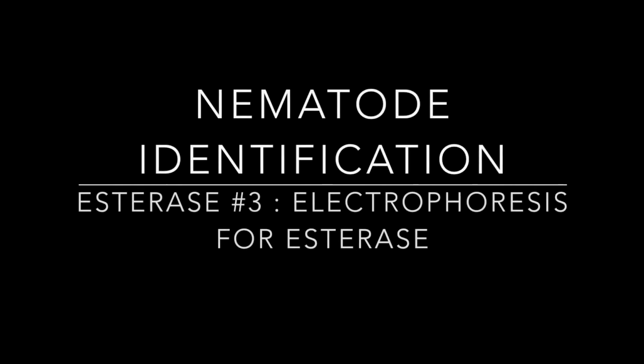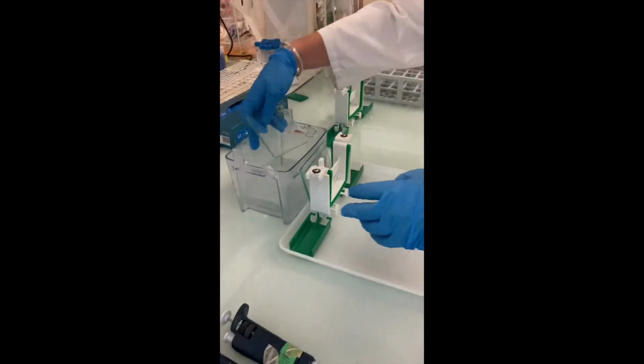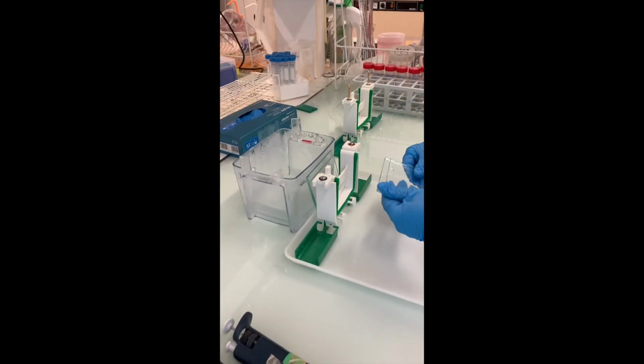Hello and welcome to this video series related to the molecular identification of nematodes by the esterase method. In this episode we will see how to load the nematode samples and highlight the esterase contained in these samples.